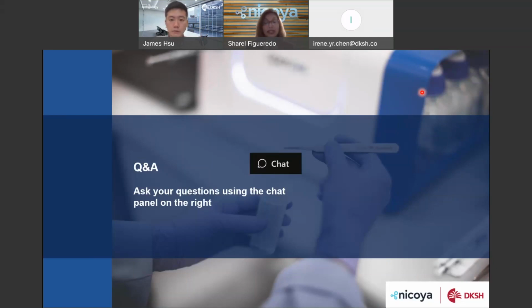So again, it depends on the size of the nanoparticle. We have already worked on nanobodies, for example. It depends on the size of the exosome or the nanoparticle, and I'm thinking if it's within the 40 nanometers, because this is the length of our sensing field, then we may be able to do just a yes/no binding.